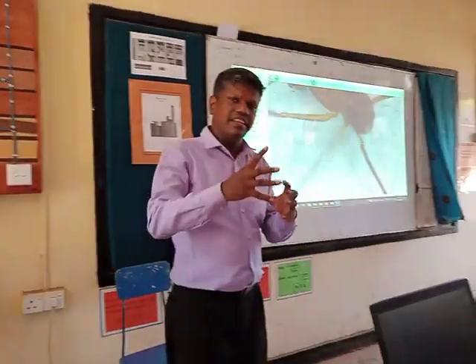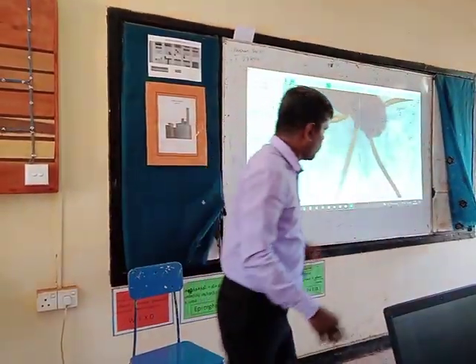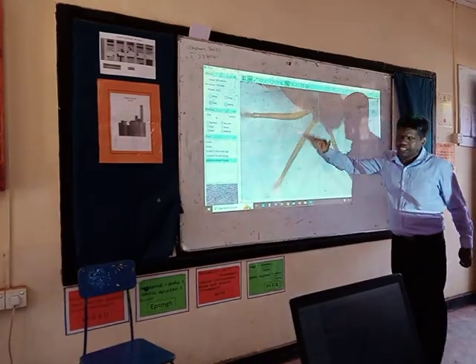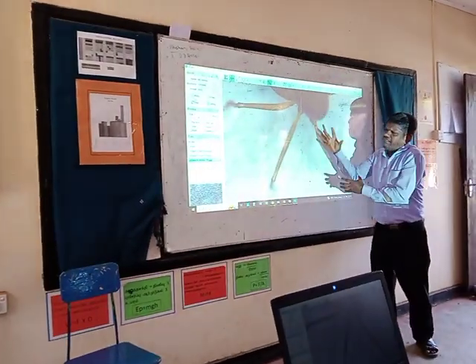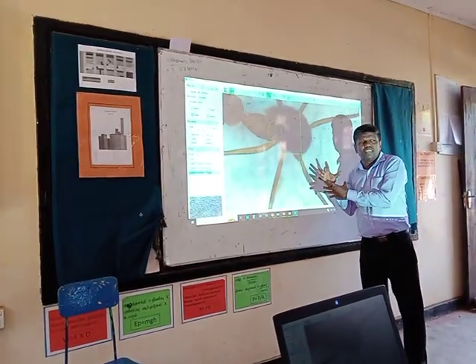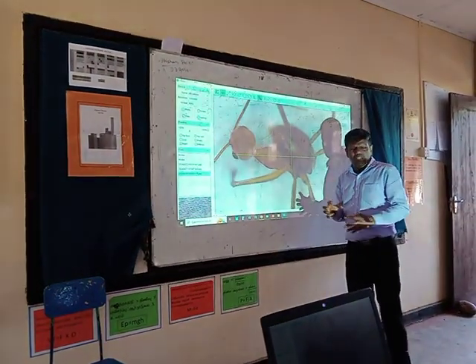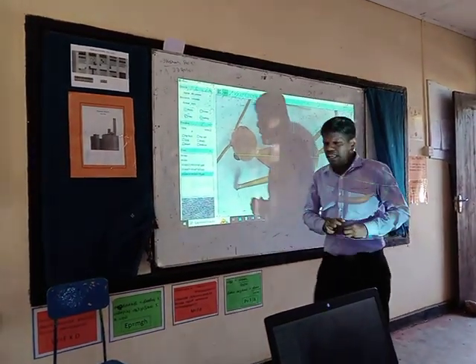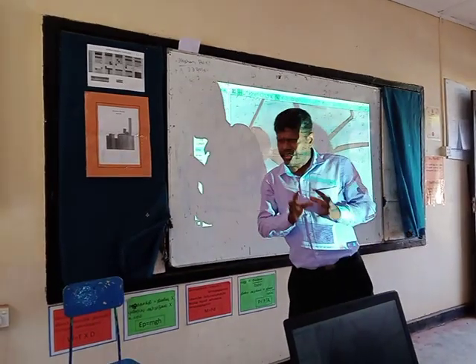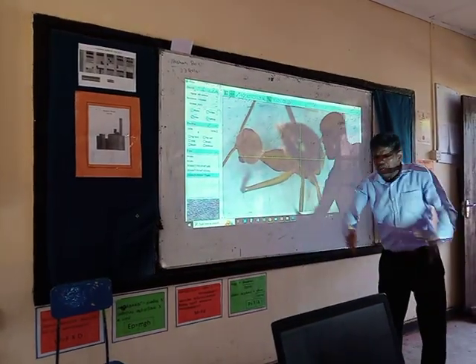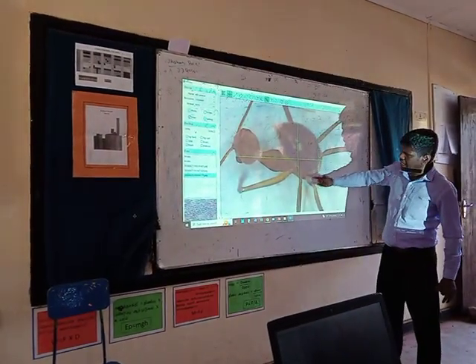Yes, because they are using the digital device with the digital microscopes. We are observing how this is really an advantage of using the digital microscopes. Yes, of course, there are some disadvantages but the advantages are so clear to see.